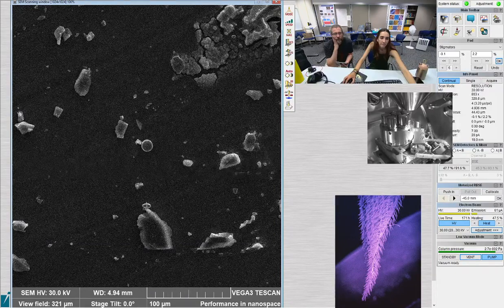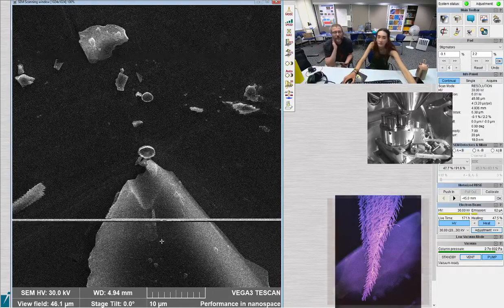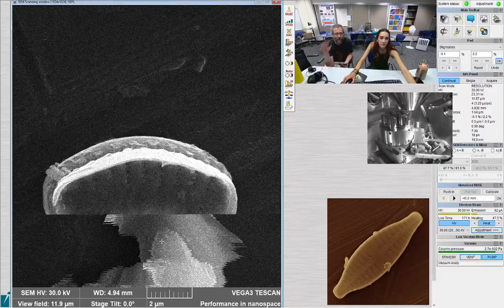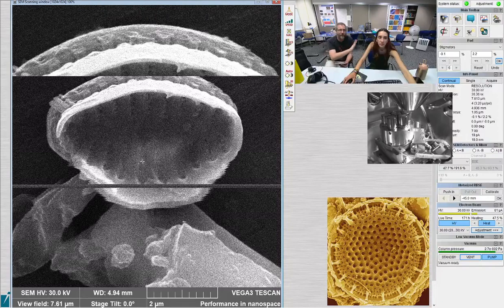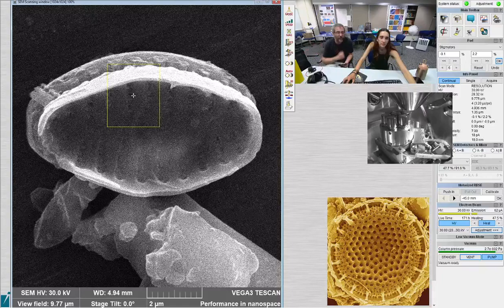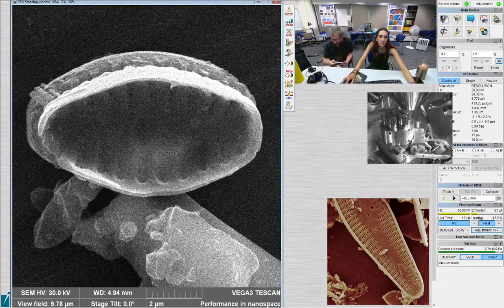But it's a little bit of a guessing game, and you can go in and tell it, oh, well, it's definitely not platinum, because there's no platinum in our sample. Then it will give you a list of other options for elements, like the alpha level of this, the beta level of this, and you can tell it which one you think it likely would be at that position, based on what you know. Then it'll fix them all the way through, because there'll be several spectra for that element. If it's occurring, all of the different electron shells should show up, not just one. Professor Melko can talk to us a little bit about it if he's still here.